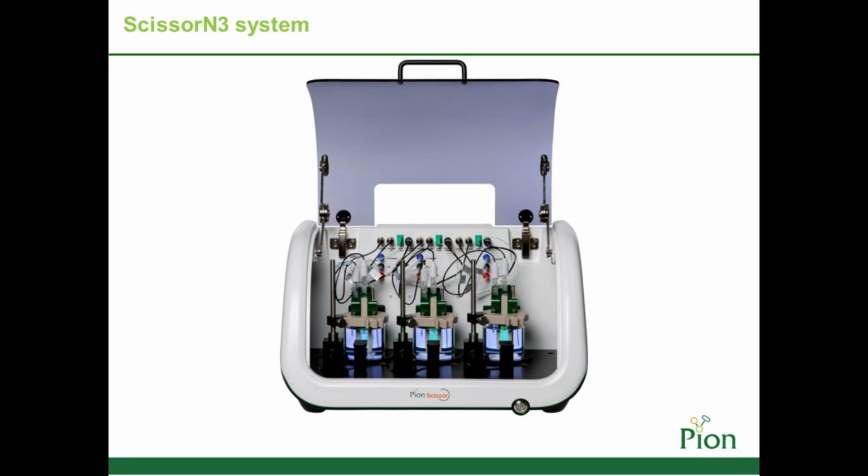There are some knowns when it comes to subcutaneous drug delivery. We know the pH of the subcutaneous space, the relative temperature, we know the general ionic composition of the interstitial fluid, and we know the components of the extracellular matrix. We also know that a lot of these characteristics can have an impact on the drug upon delivery, which could then impact the eventual bioavailability of the drug. We've tried to incorporate as many of these knowns into the platform to better reflect the human in vivo situation.